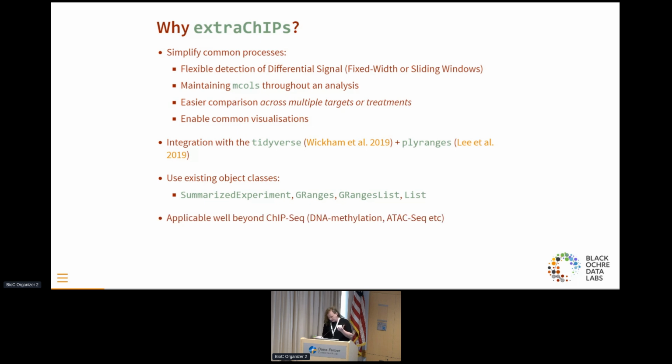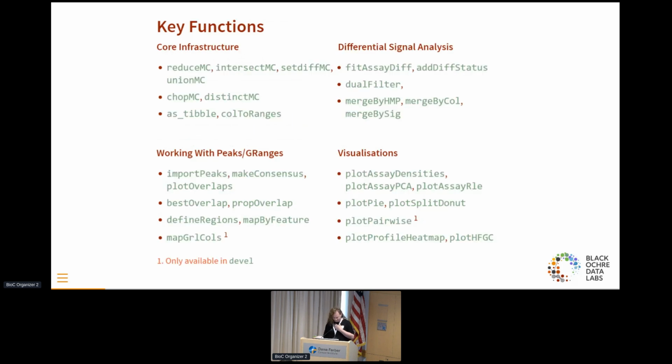And we've since discovered that it's applicable well beyond ChIP-Seq. So some of the stuff I've done here, one of our data sets we're looking at in my current project is DNA methylation. And Sam Buckbury, who's working on that, is very interested in trying to see where there are some connections here. And I've just started looking at ATAC-Seq as well. So I'm hoping to make the package usable for all of those different contexts.